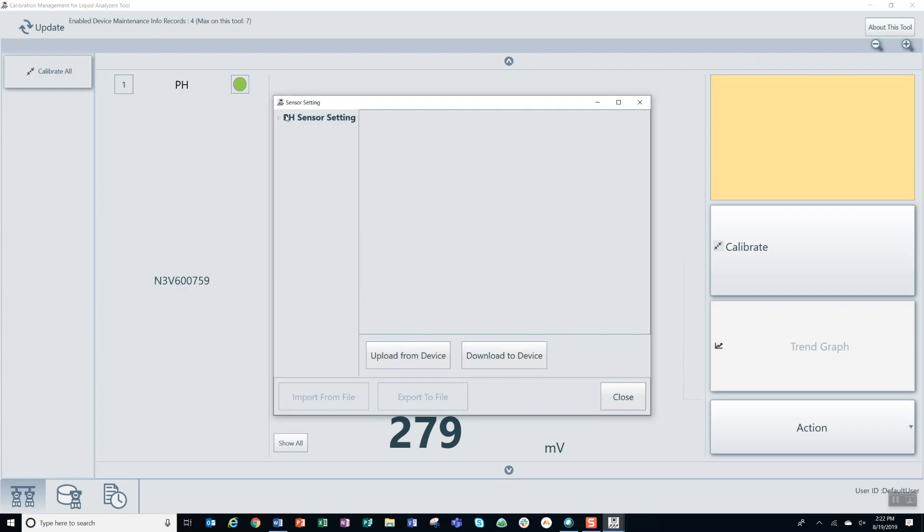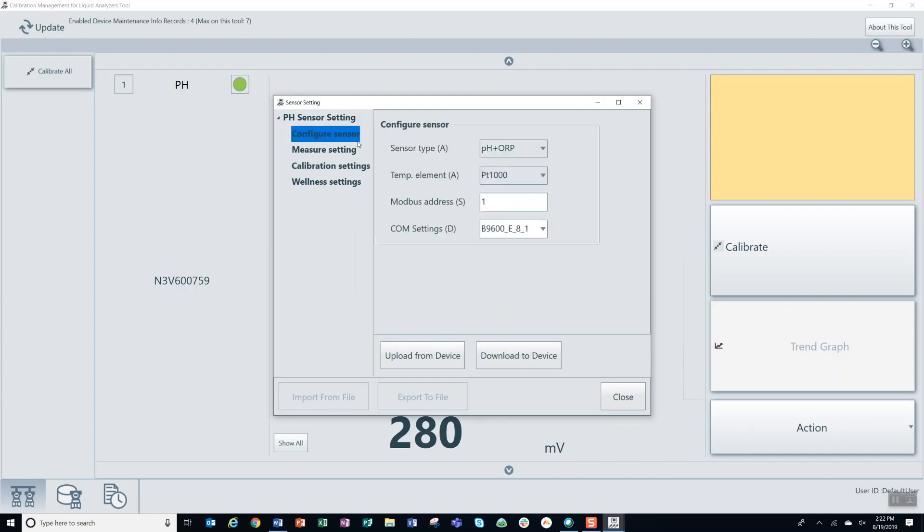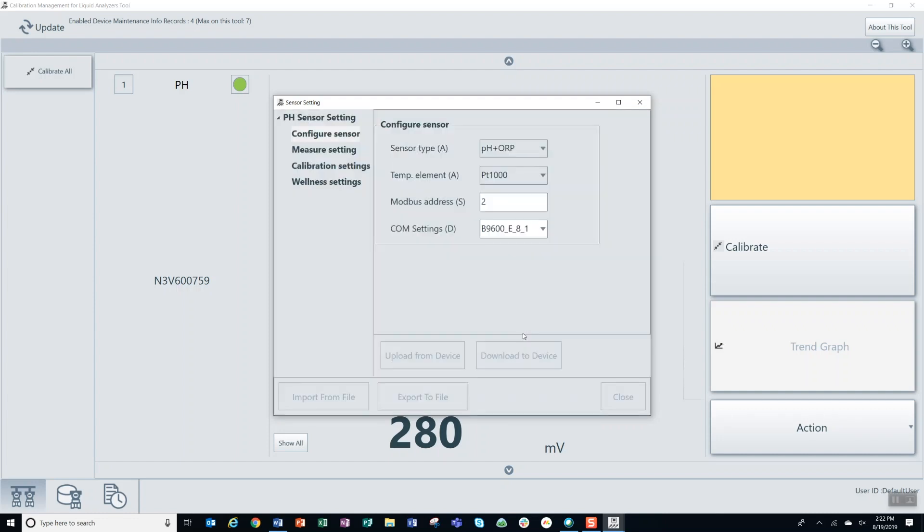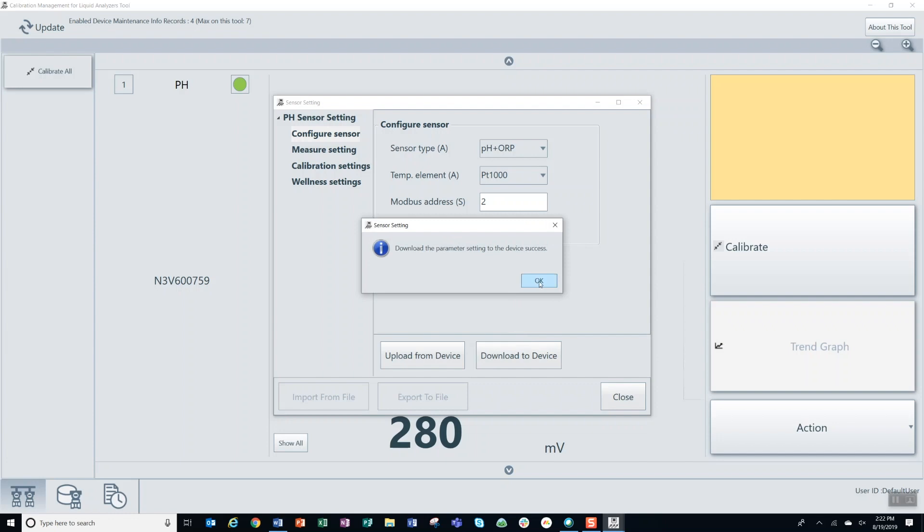Click OK through any dialog boxes, then drop down the pH sensor setting and from there go to configure sensor. Here is where you will change your Modbus address from 1 to whatever you would like. In this case we are using Modbus address 2. Make sure to click download to device, click OK through the dialog box, close it out, and you are good to go.